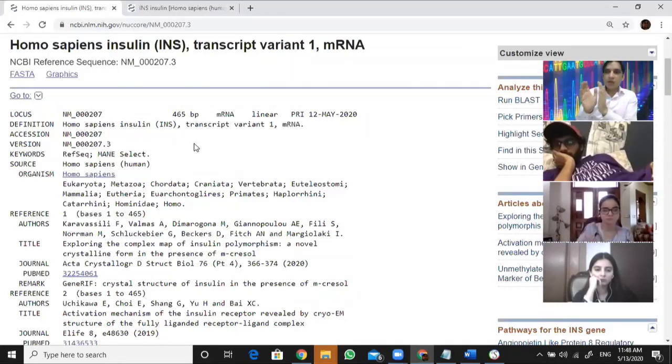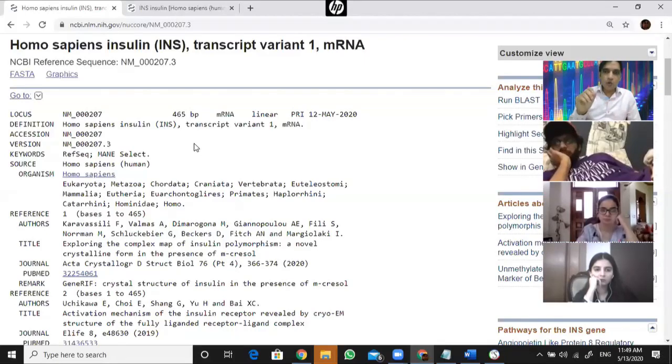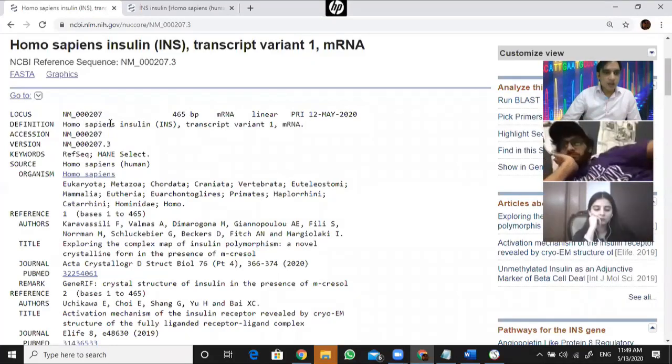So, this is an exon. Naming that portion as an exon is like giving a feature to that part. Like this is a 5' UTR region, so giving that portion a name is called featuring that name. And you should know how to add and remove features as well, not on the NCBI, but in your own hands. So can you start with the understanding?